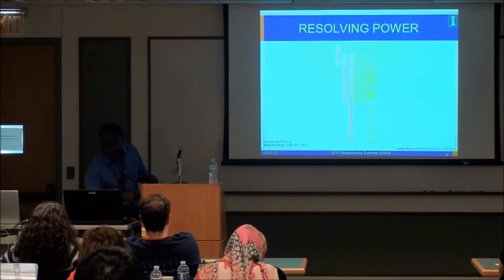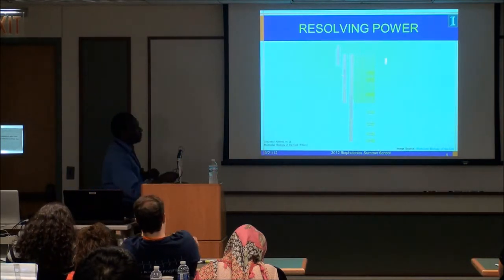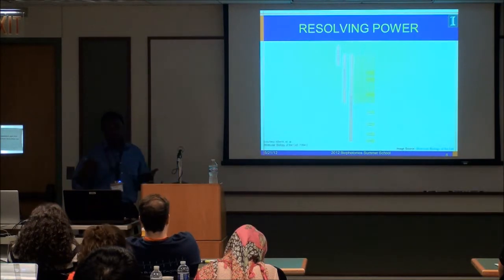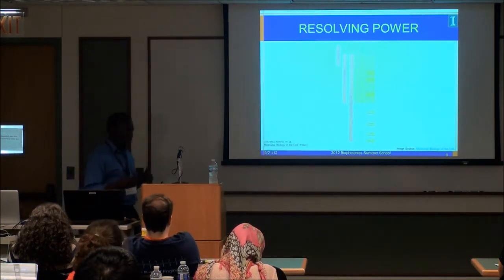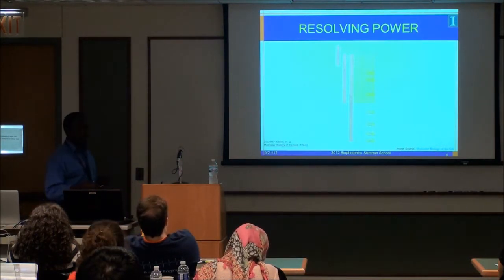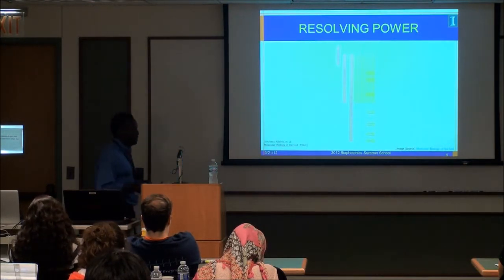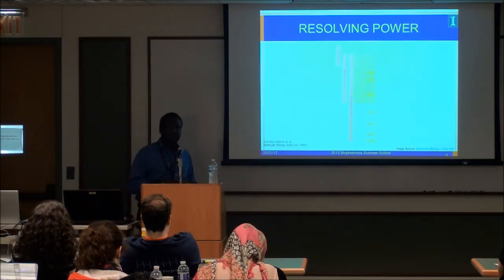So the light microscope covers this range. So we're talking about on the order of millimeters on scale, covering cells, microns, as you move down, bacteria, until you get to what we know as the spatial diffraction limit, which the professor talked about, I know, in the last lecture that he gave you guys. So that's going to be on the order of a couple of hundred nanometers, maybe 300 nanometers, based on using visible light. If you want to see viruses and proteins and molecules and atoms, currently you can't do all that using a regular light microscope.